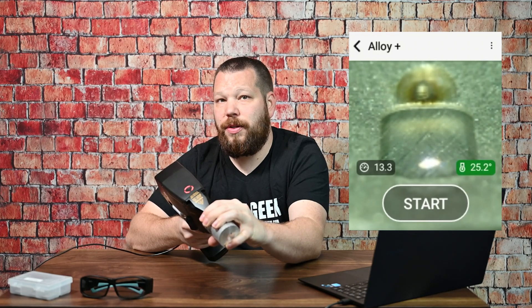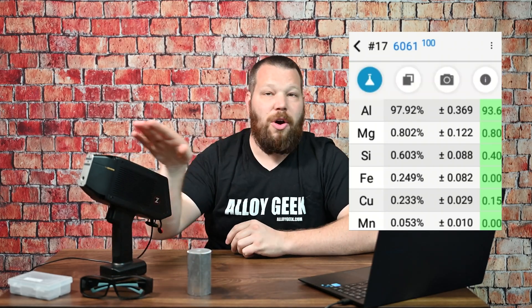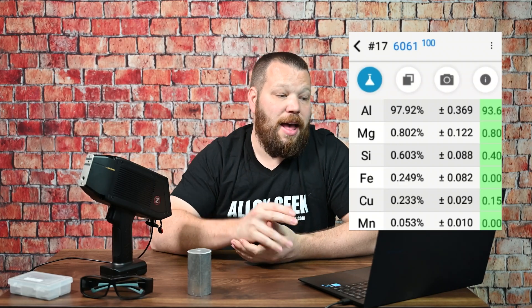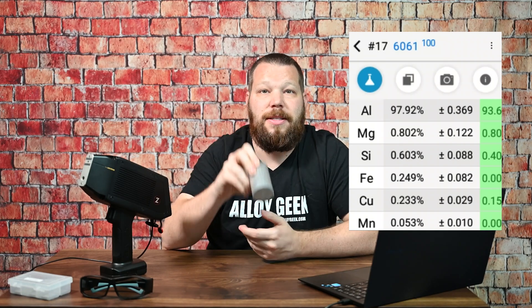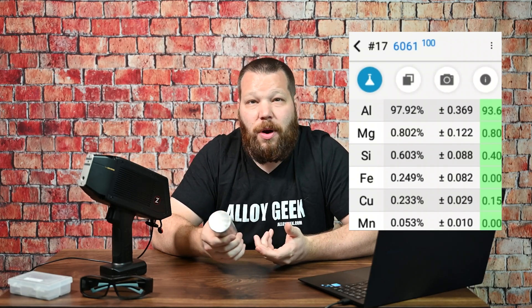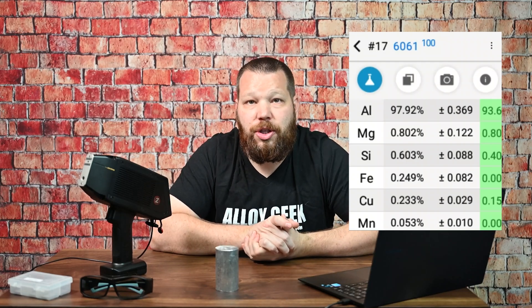While I'm doing this analysis, I need to hold still. So what you just saw was this device actually doing a laser induced breakdown spectroscopy — that's what LIBS stands for — test. The results you get are a direct result of not only your surface prep but the material underneath. So if you have a clean sample like this one — this is a shiny sample where I've actually taken a grinder and polished the end — this is a great sample to test. If you have paint or other coatings, this device will not be able to shoot through that. You're going to need a nice clean sample, and if you have that, you're going to have no problems. Just point and shoot, you're ready to go.